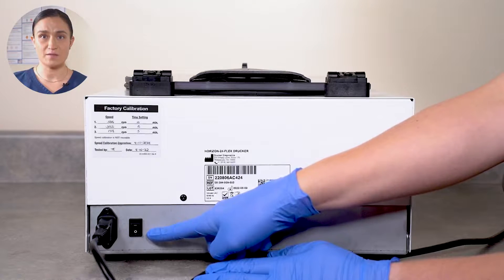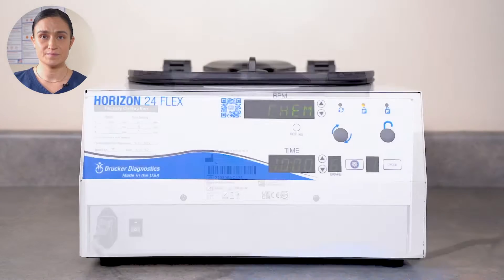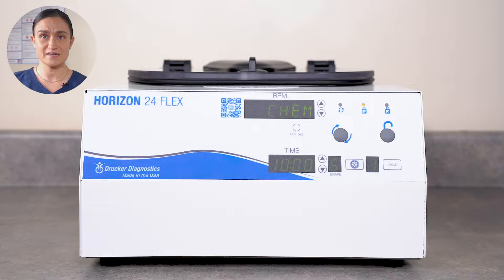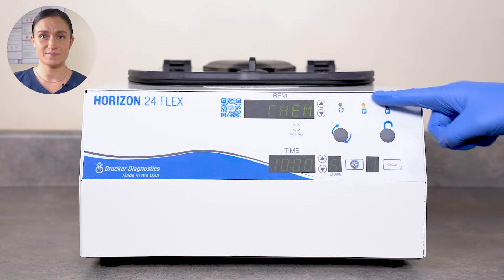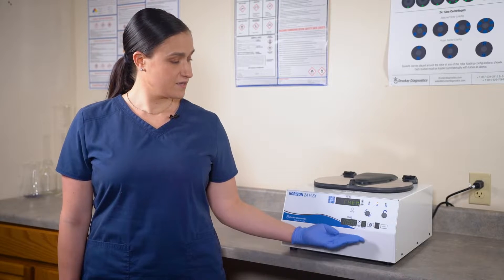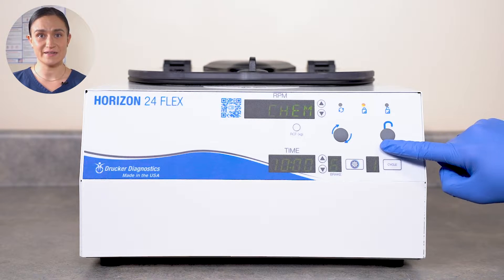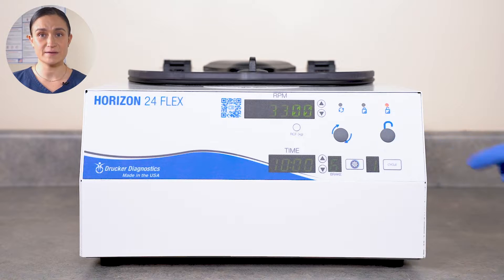Locate the power switch on the back of your Horizon 24-Flex and flip it to the on position. With the centrifuge plugged in and switched on, its displays will illuminate. Now we're ready to unlock our centrifuge. Your Horizon 24-Flex has a safety lock. The centrifuge will lock whenever the rotor is spinning, 60 seconds after a cycle has finished, and it will be locked when your centrifuge arrives from our factory. To unlock it, look at the control panel and press the Stop Unlock button.